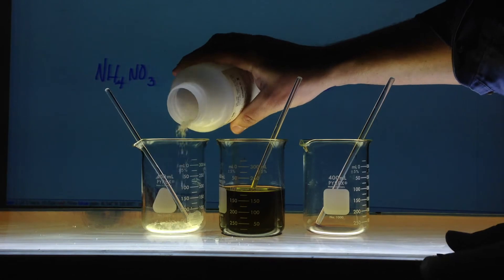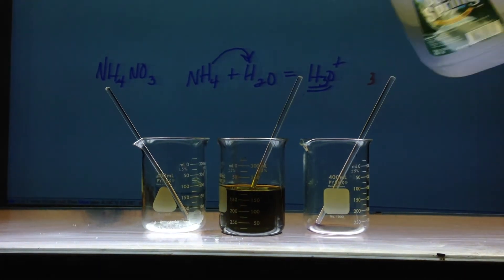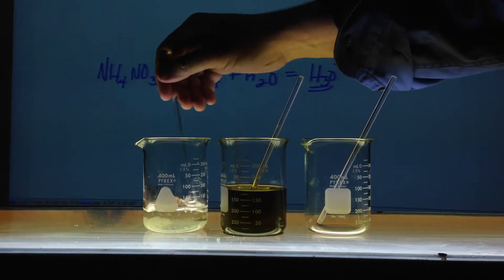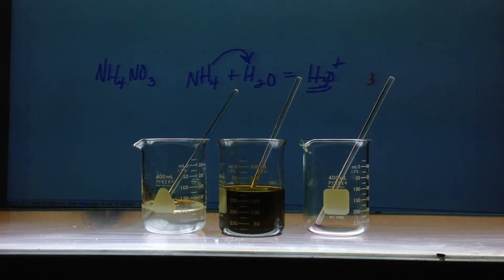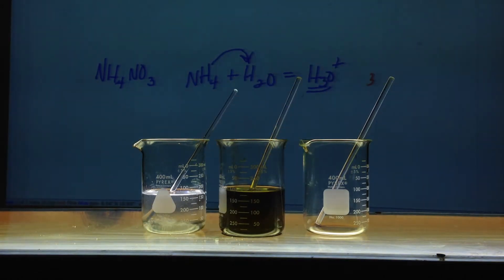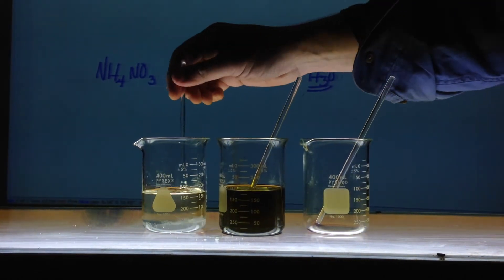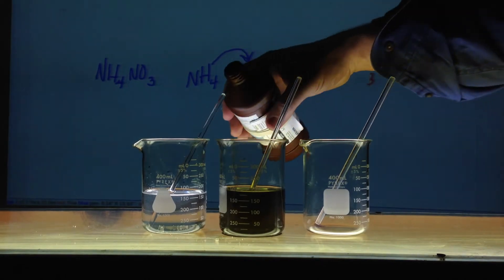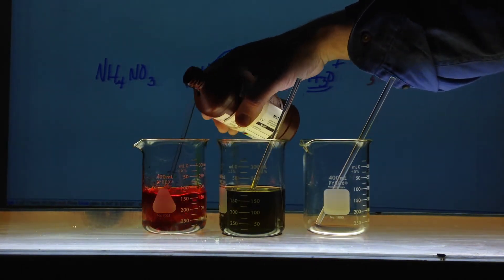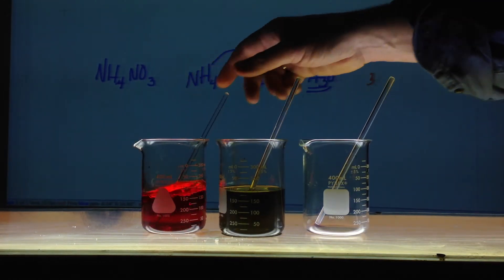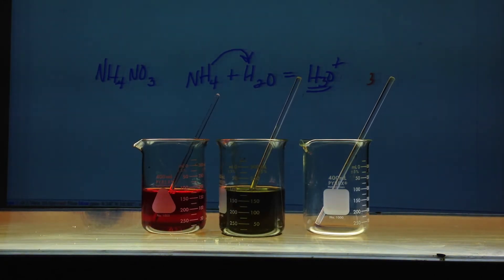Here's some ammonium nitrate, and add some water to it. It's very soluble, because nitrates are very soluble. You've got four atoms spreading a negative one charge, so their coulombic attractive forces are not going to be strong. So, it definitely loves to dissolve. Let's add the universal indicator, and it should be in the red range. And, there it is, very acidic, for reasons we explained. The NH4+ can give an H to the lone pair of electrons in a coordinate covalent bond.